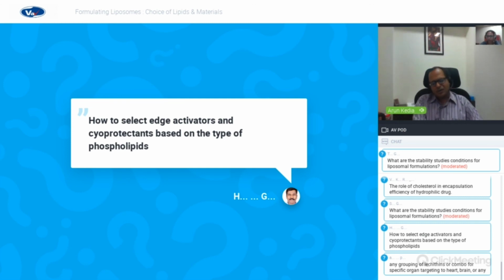And then the third part is that you can always add a more gentle cryoprotectant. So our recommendation typically is minute quantities of sugars or carbohydrates, and if necessary, a small amount of glycerol. We don't recommend use of high quantities of cryoprotectants, simply because lyophilization is not the only choice of drying liposomes.